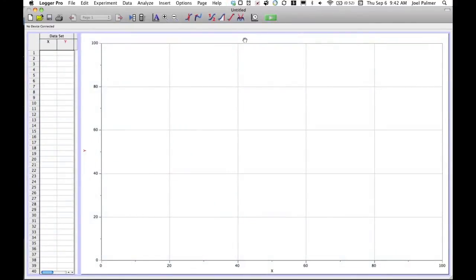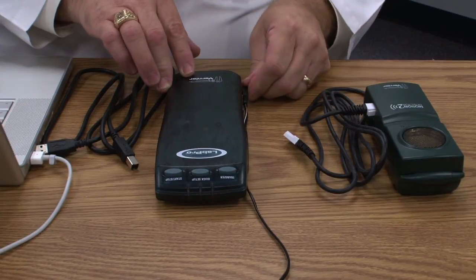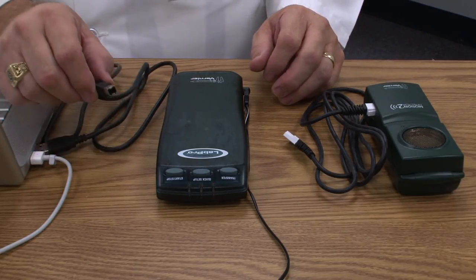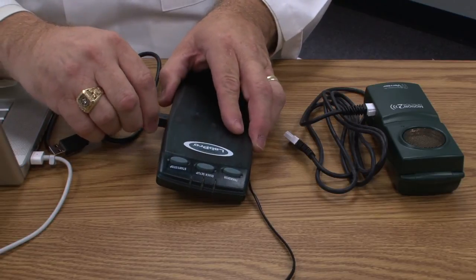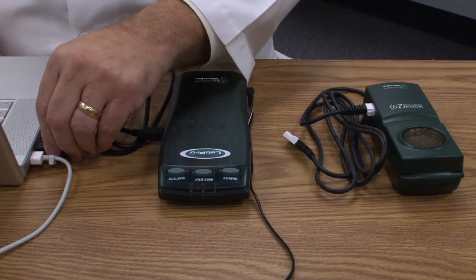When Logger Pro first opens up, if you don't have a LabPro plugged into your computer, you'll get just a basic blank screen. To connect your LabPro: step one is to plug in the power — when you plug in the power you'll hear it beep, which is perfectly normal. Next, take the D-shaped USB and plug it into the side of the LabPro. Once that's done, take the other end of the USB and plug it into any USB port on your computer.